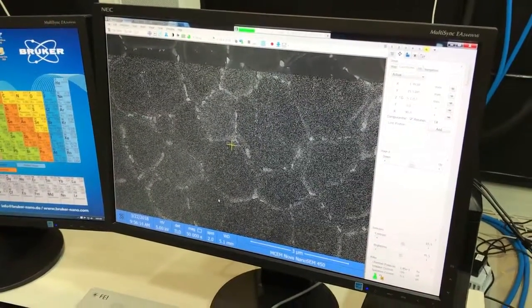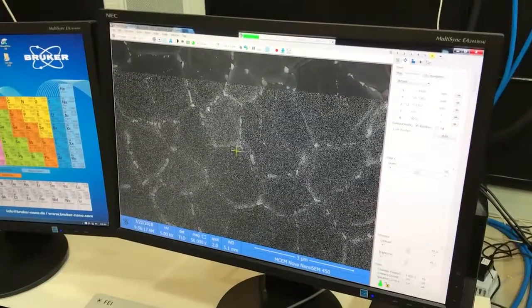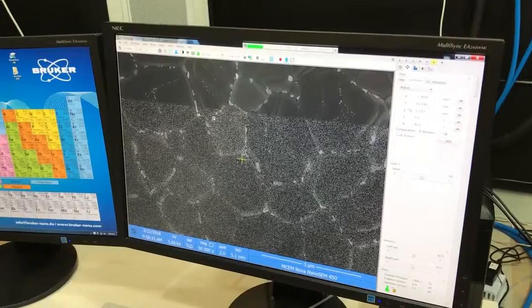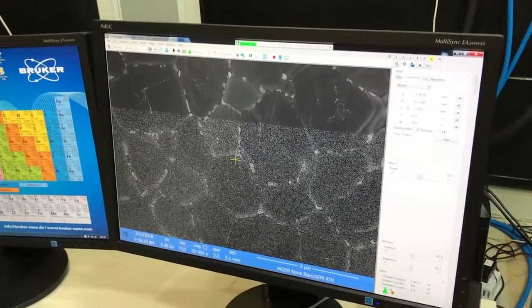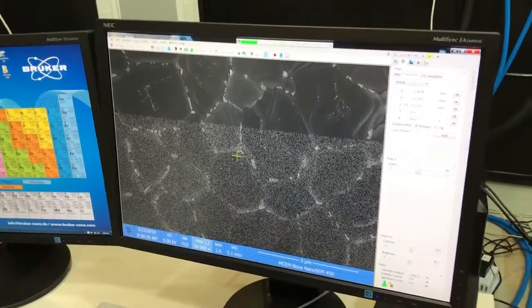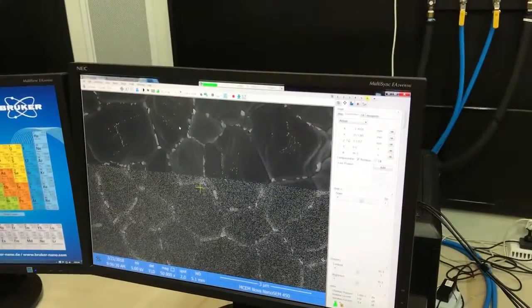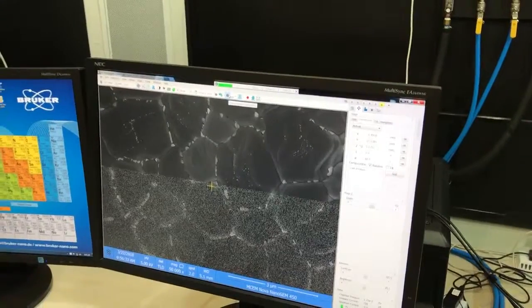So now I've just reduced my voice because the vibrations from me talking could upset the scan potentially. Oh, really? Yes. So when he's taking a really nice image, I should actually shut up because I'm standing right next to the column, so I'm just whispering into the phone now.